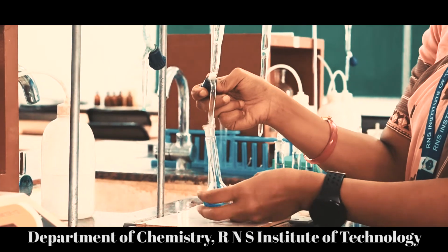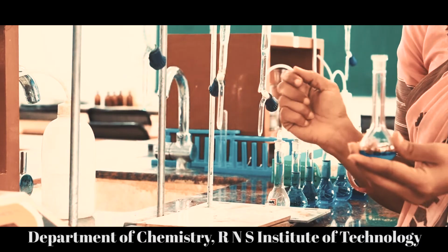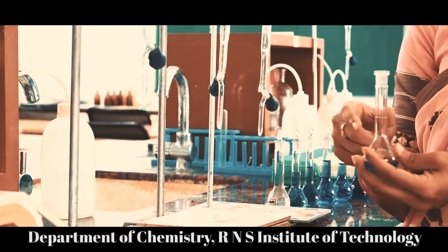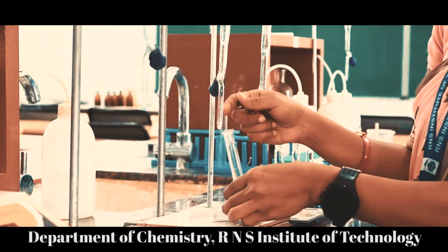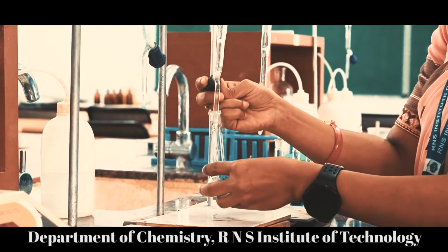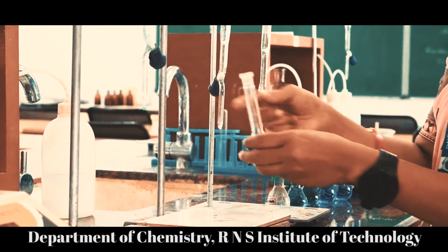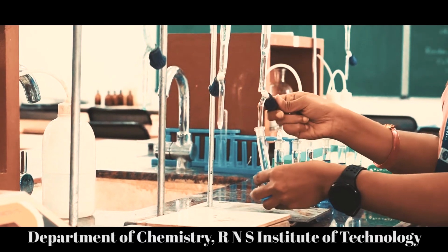This is the unknown solution. An unknown amount of copper sulfate or electroplating effluent is given, and 2.5 ml of ammonium hydroxide is added to the solution. Dilute this solution with the distilled water and make it up to the mark.